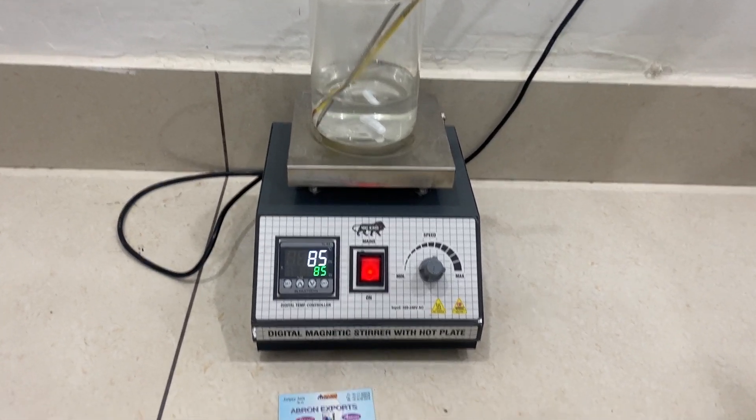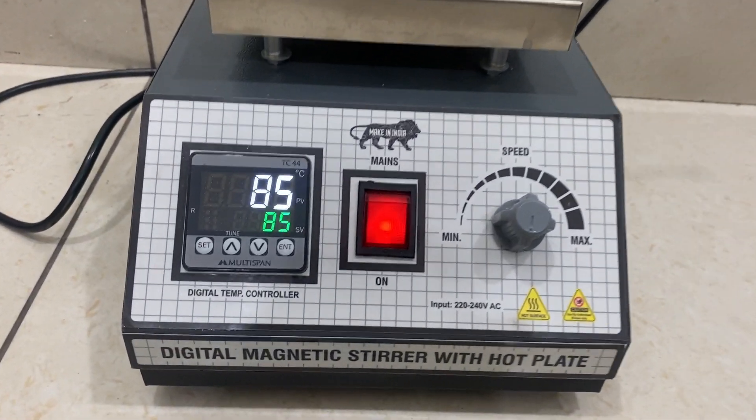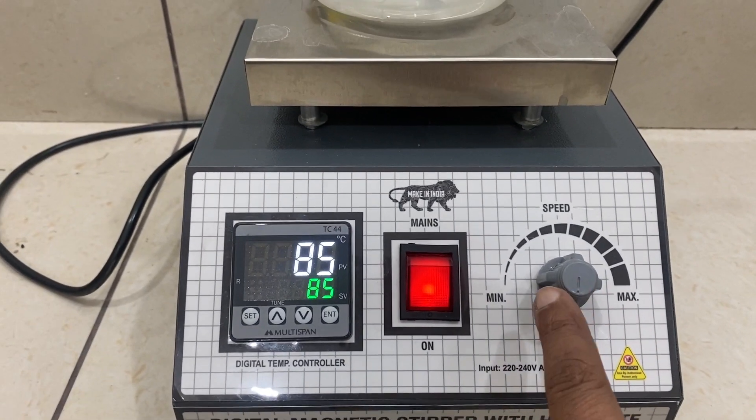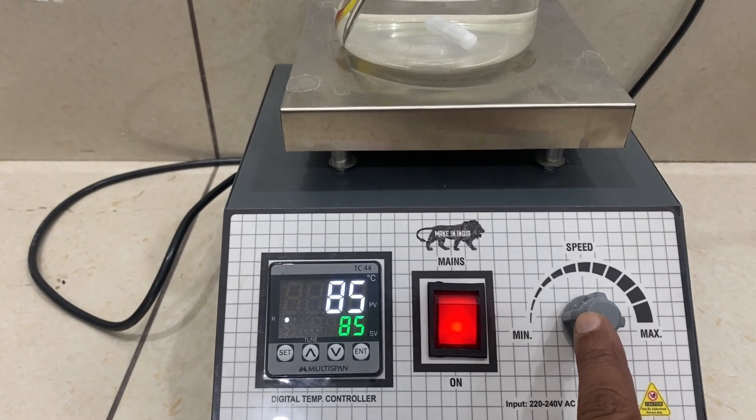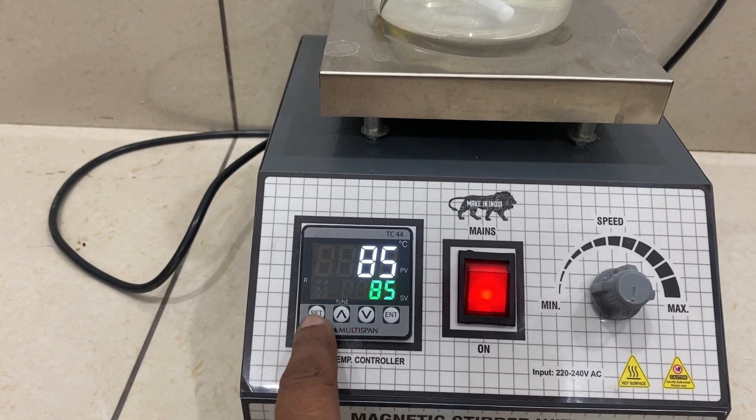Welcome to another video by Abron Exports. This is a magnetic stirrer with hot plate and digital temperature controller. This one is a speed controller for the stirring, and this is the on/off switch for the hot plate.